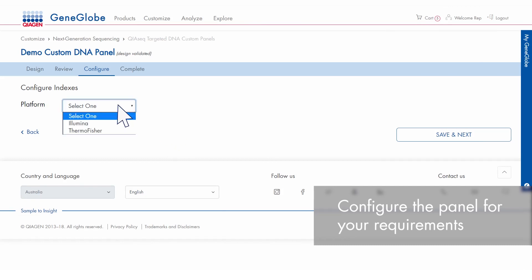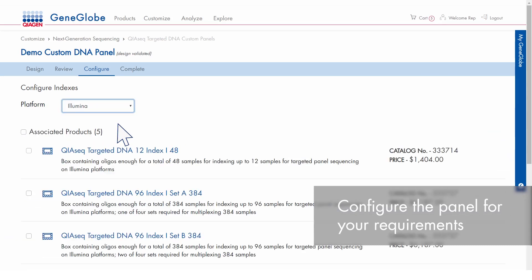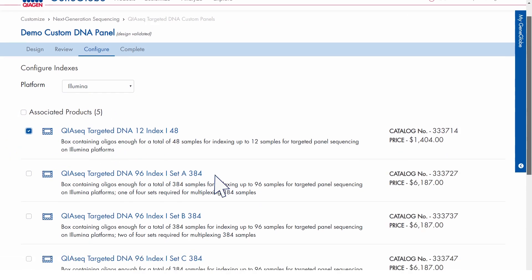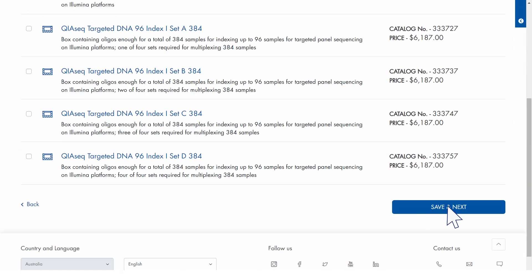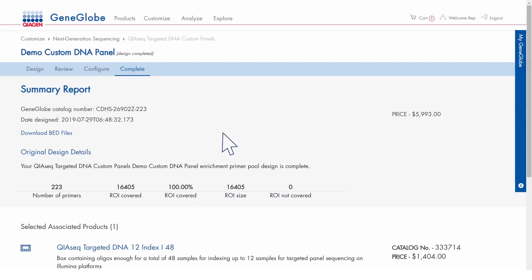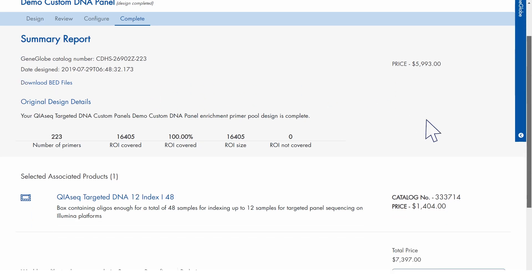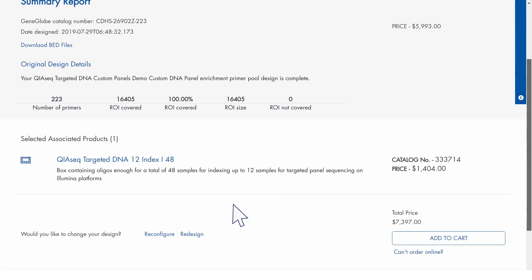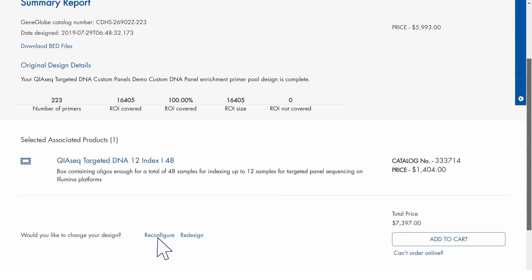Select your sequencing platform and then choose an index kit to match your throughput. View a summary containing your unique catalog number, design date and time, price and the selected indexes. To make changes, click Reconfigure or Redesign.